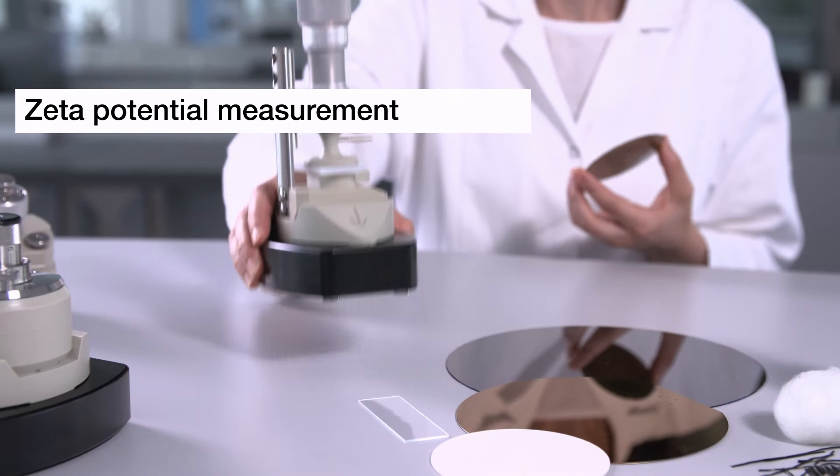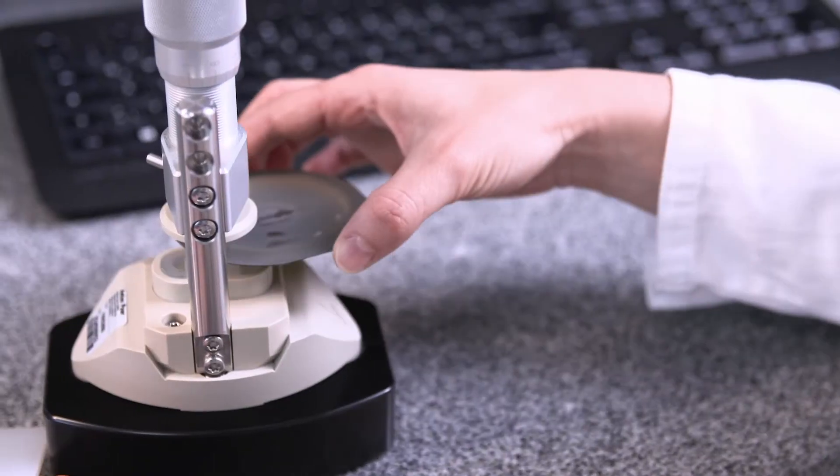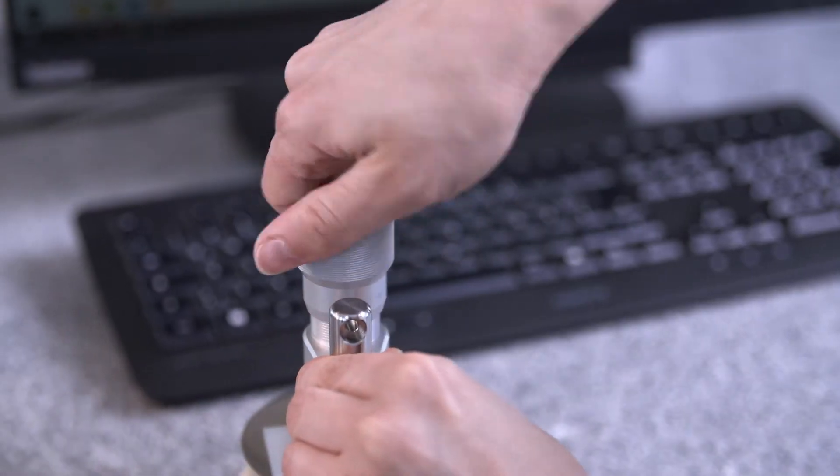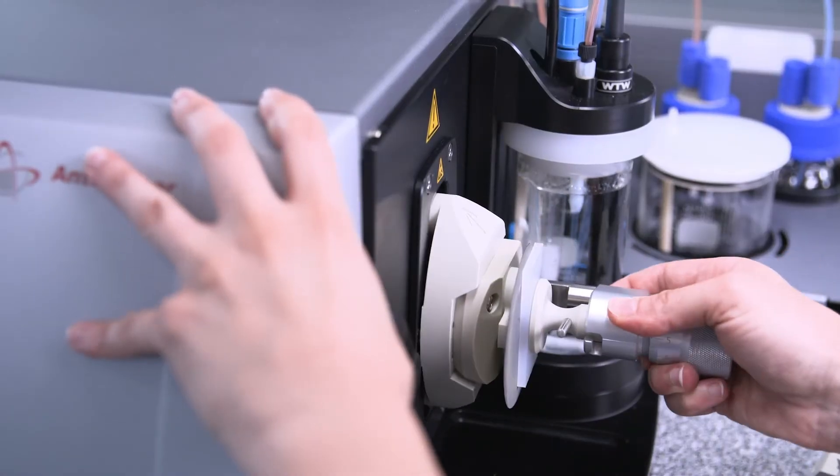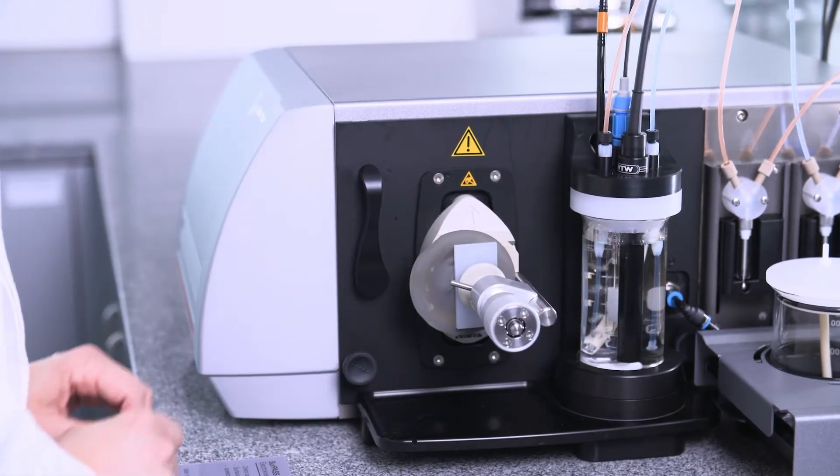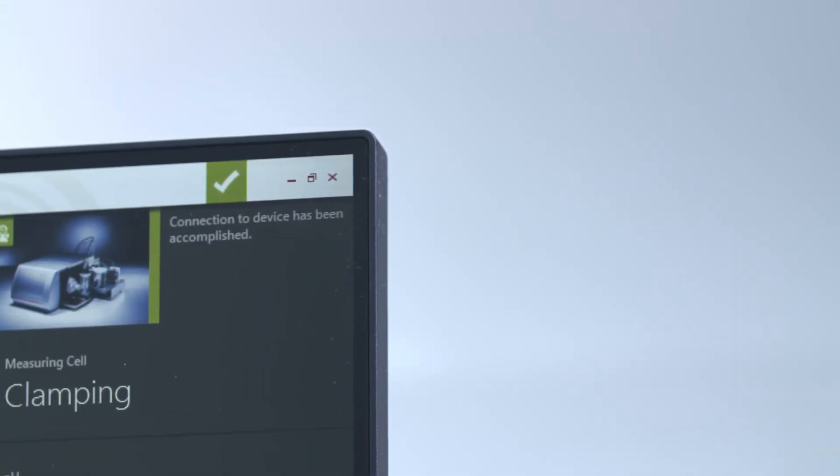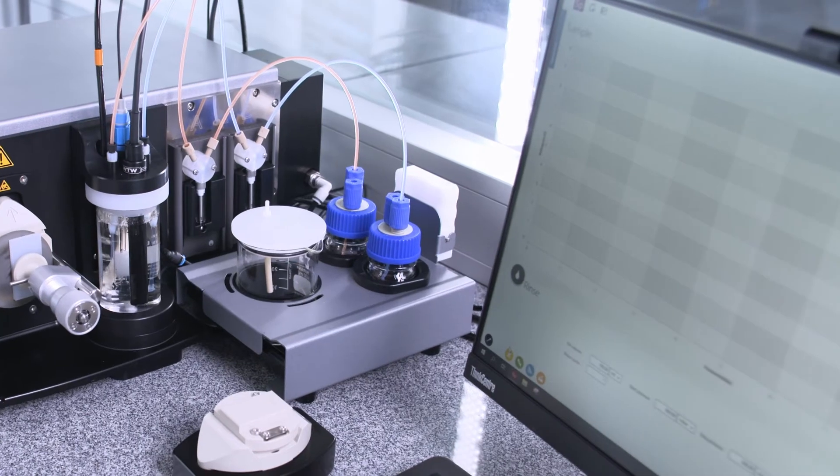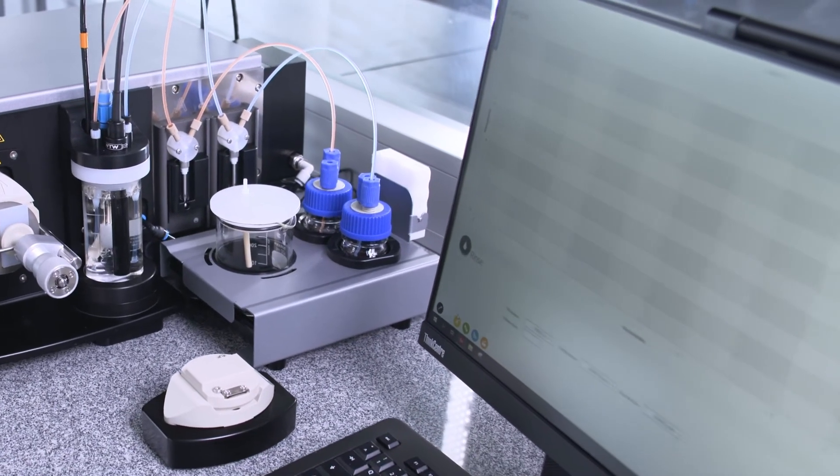To perform a zeta potential measurement, the sample is mounted in a suitable measuring cell. Once the measuring cell is attached to the main instrument, the Surpass 3 software automatically detects it. This plug-in and start functionality lets you exchange measuring cells quickly and easily.